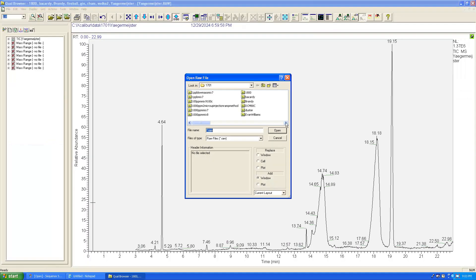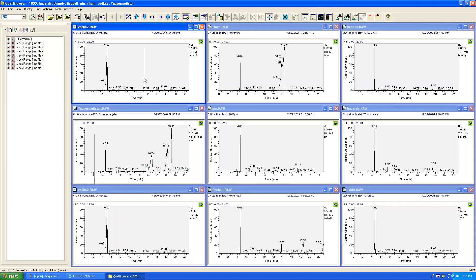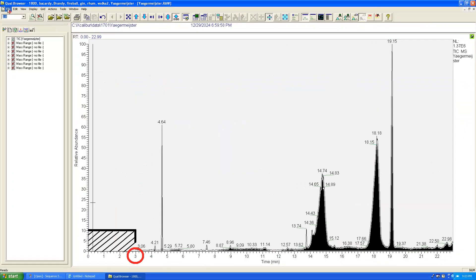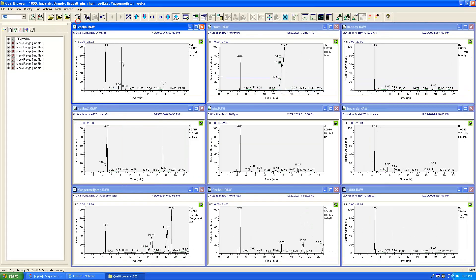I injected five microliters of my extract using 150 degrees injection port and keeping the column at 80 degrees for 23 minutes. I keep the mass spectrometer on standby for the first three minutes to allow for the DCM to pass and not mess up my detector and filament.